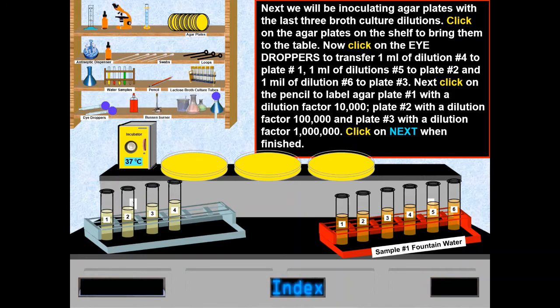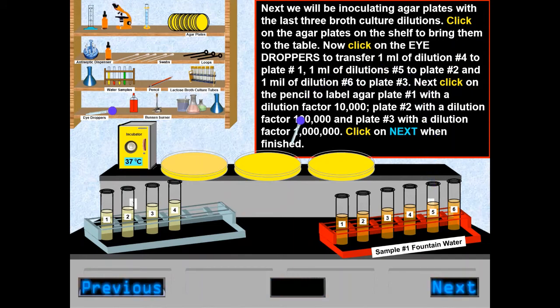1 ml of dilution number 5 to plate number 2, and 1 ml of dilution number 6 to plate number 3. Then the agar plates were labeled with pencil.